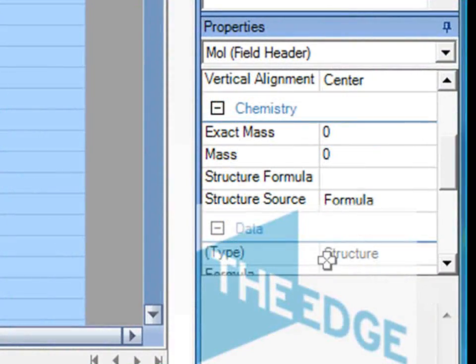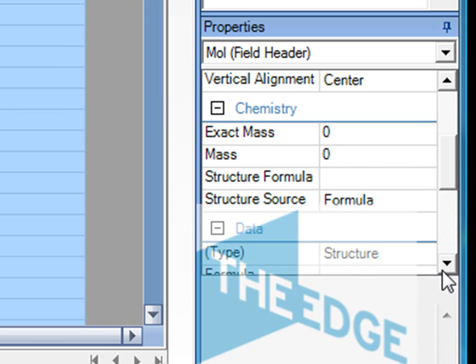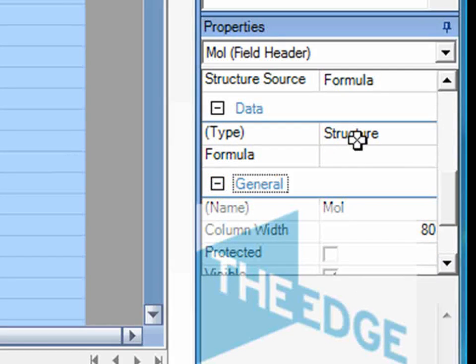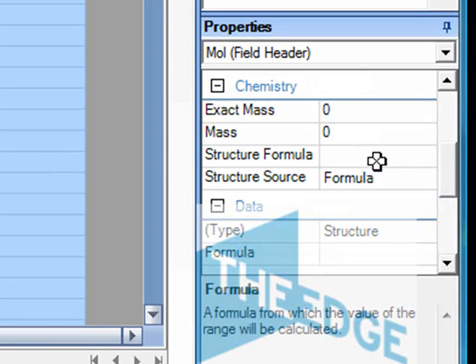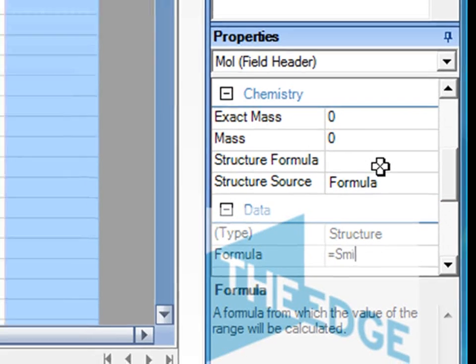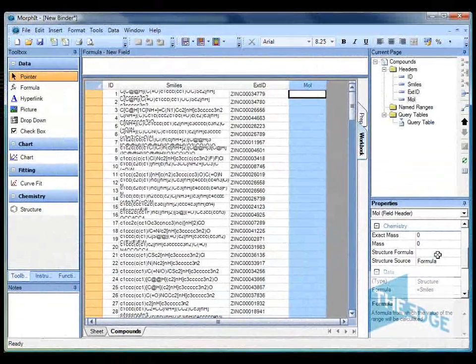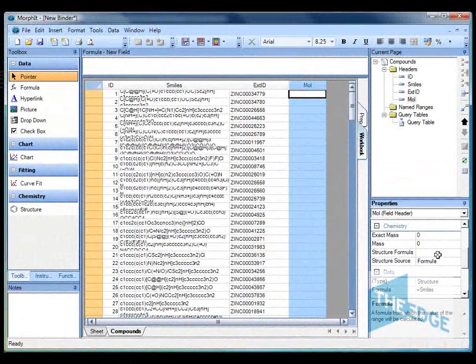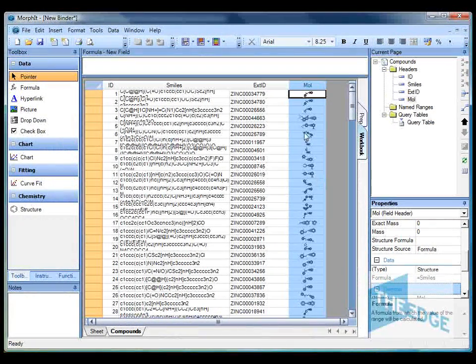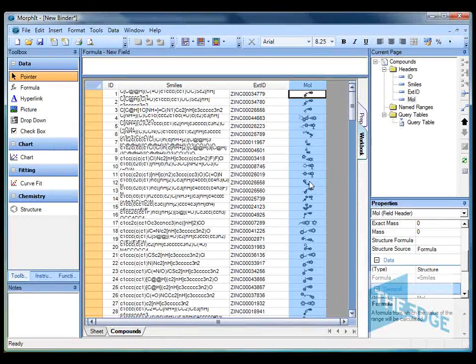You'll see now that it's modified and added some extra properties within the properties panel. So I'm now going to add a formula which says to fetch the molecular structure from the smiles column. And you'll notice immediately all the structures have been displayed in this column.